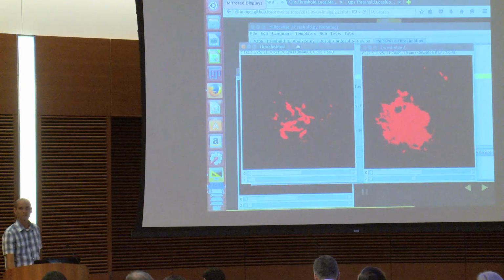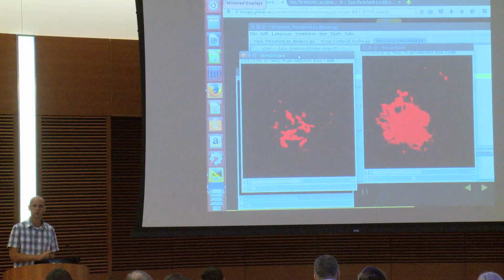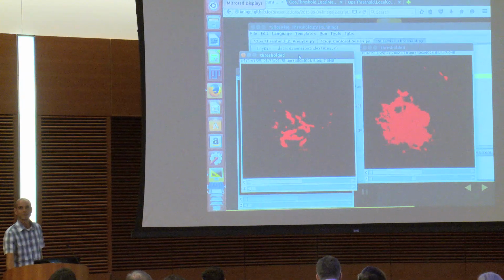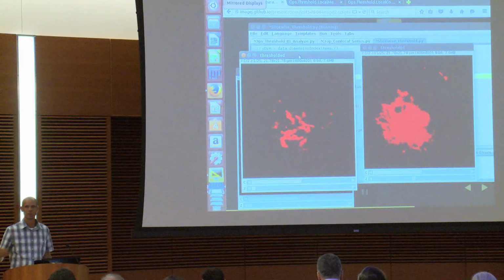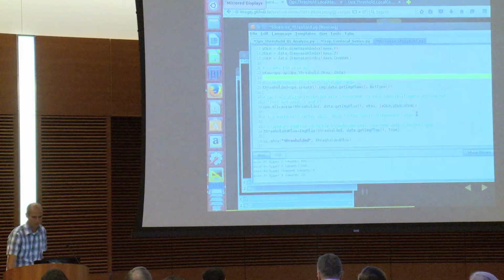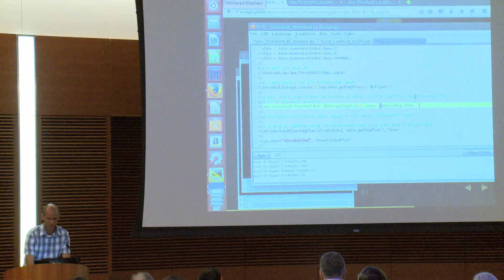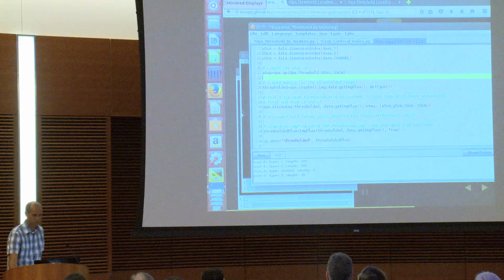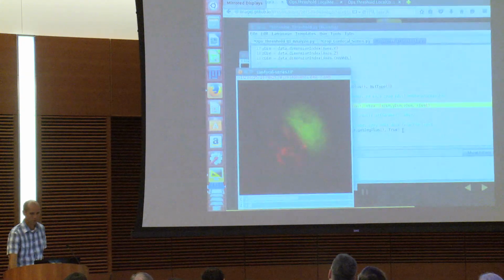Yeah, I think that's exactly what we did here, if I understand your question. When I passed x and y, it said use each slice. When I passed x, y, z, it was like each volume, and then you could actually pass c. The result might not make sense, but this time it's going to use the entire data set.